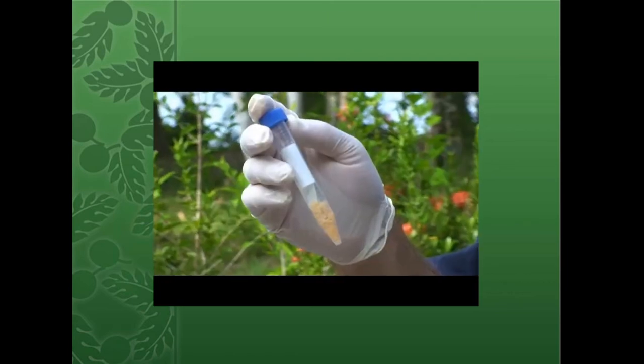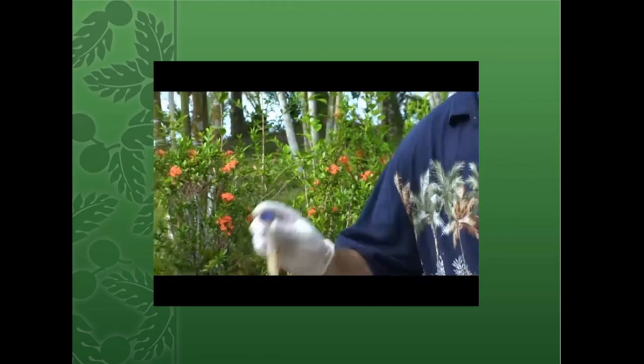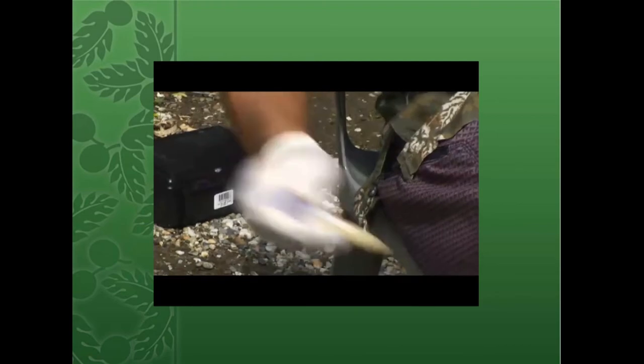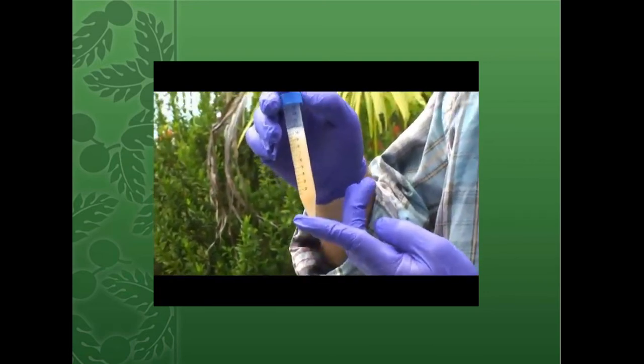The Gilson's fluid will begin working on its own, but you're going to help that process along by shaking it every day. Next day, shaking again the next day, shaking again the next day, shaking again the next day until it looks like all the eggs are free.